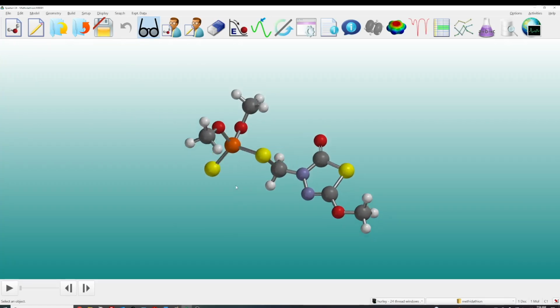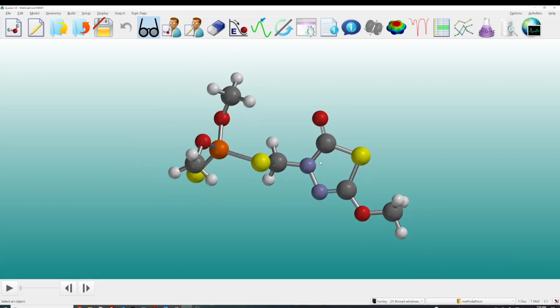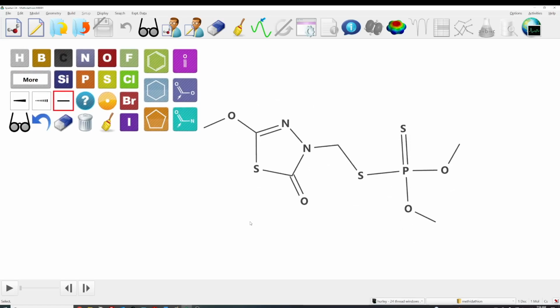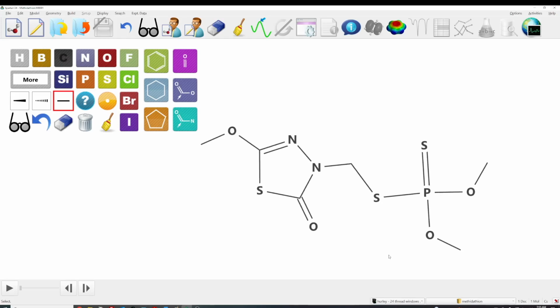And we will open that and then do a minimization, put it in 3D, just do a molecular mechanics cleanup and put it in 3D like we would from our building environment. In 3D, but you can certainly go and look at that in 2D as well. Again, our 2D environment is intended as an input, so it's not as polished as programs like ChemDraw that are intended to provide publication quality 2D images. Okay, enough about that. Let's now talk about how the 2D sketch interface is designed.